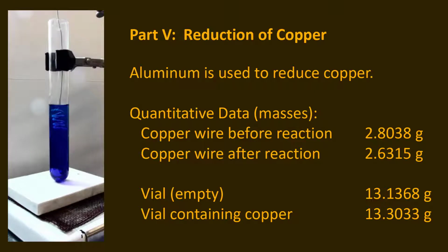Now, one of the things that you might also see is that there's a slight color change, and that's also because as we add a little bit more acid, what's going to happen is that we're going to protonate both of the sites on glycine that would stick to the copper, and that means that the glycine's not going to be an effective ligand anymore.